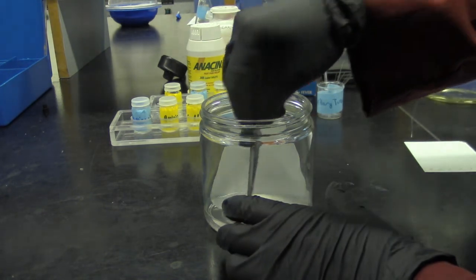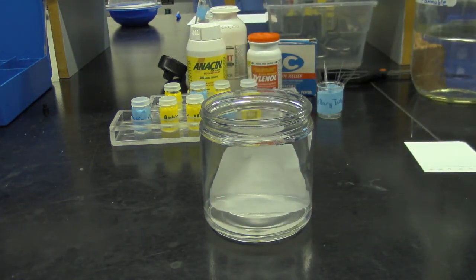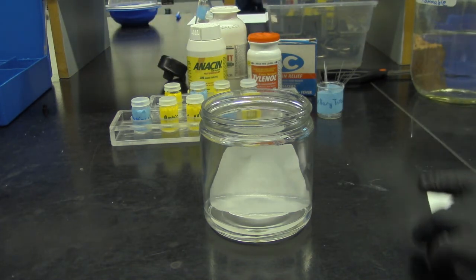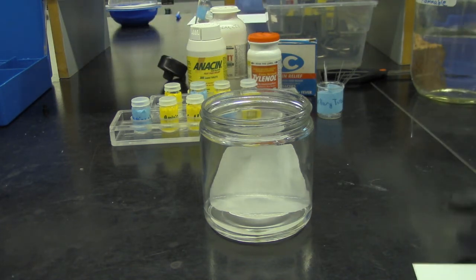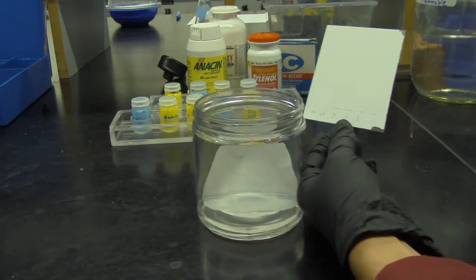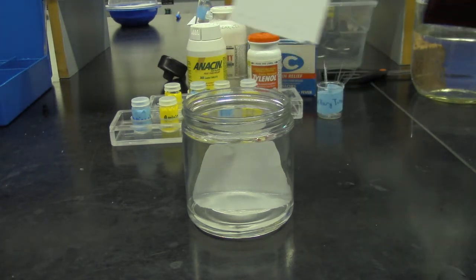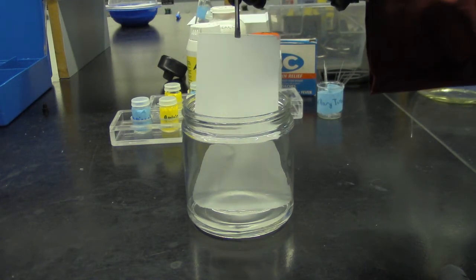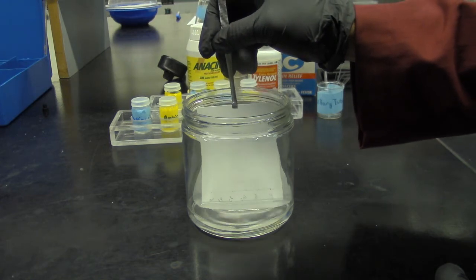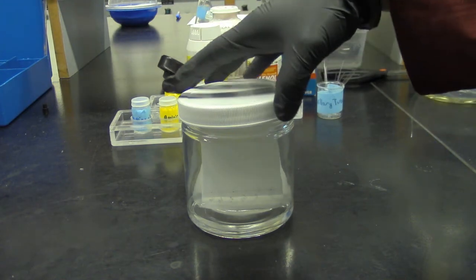So it's good, and you want to lower the plate into the TLC developing chamber, right? So I just hold it and slowly put it down. Okay, and close the lid, right?